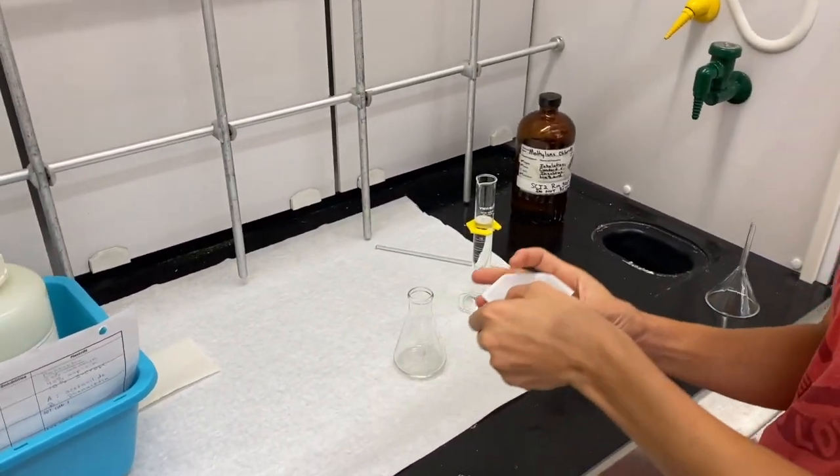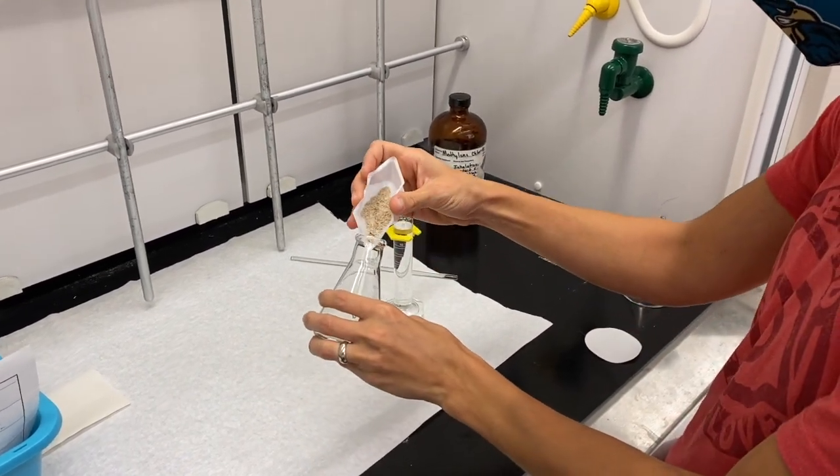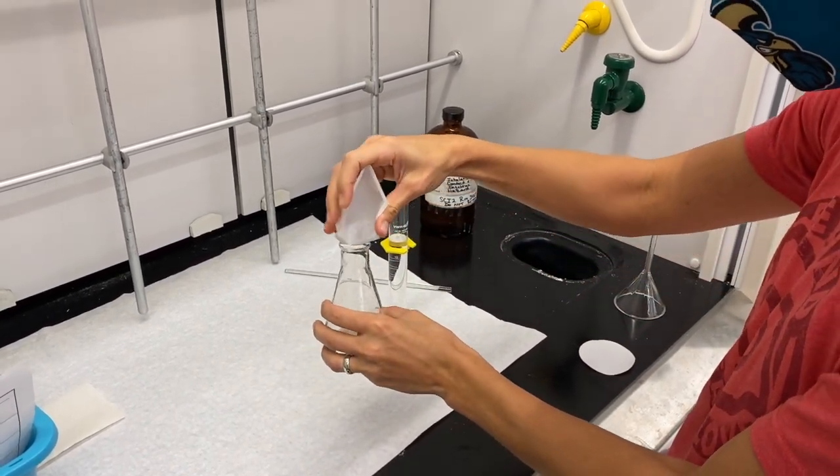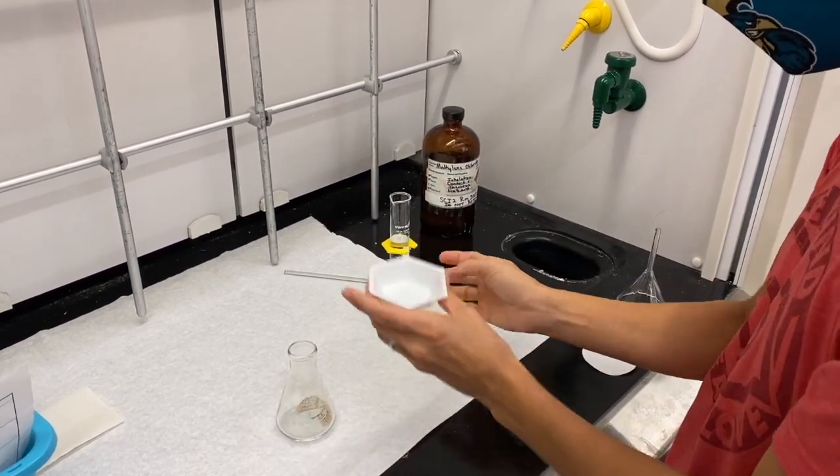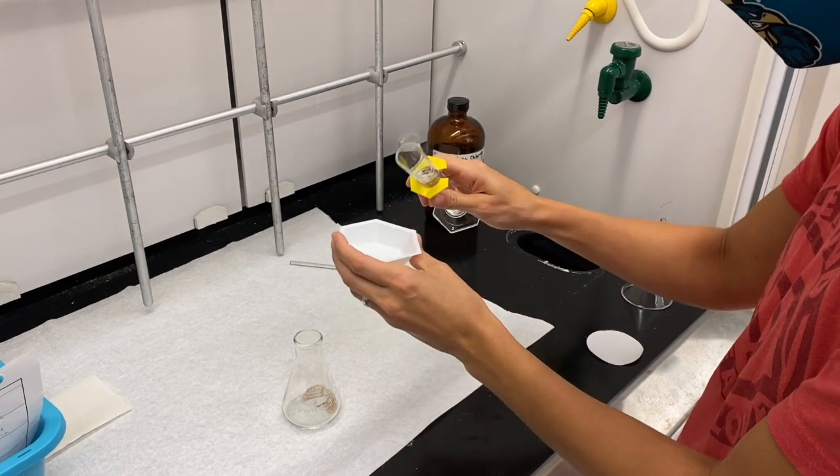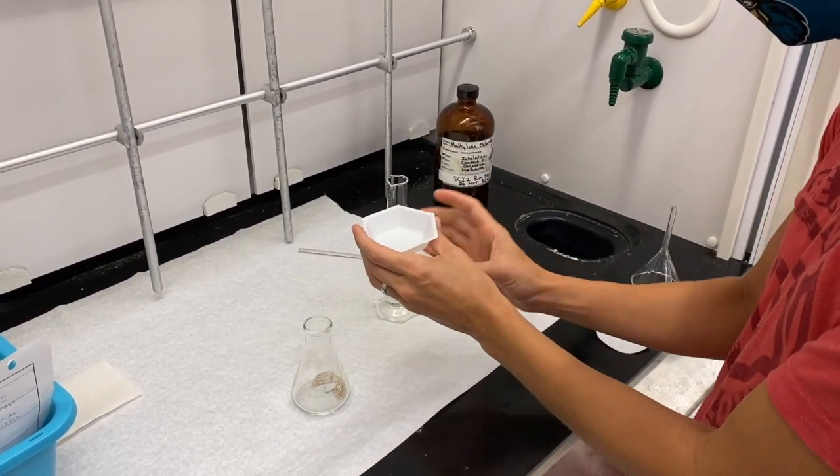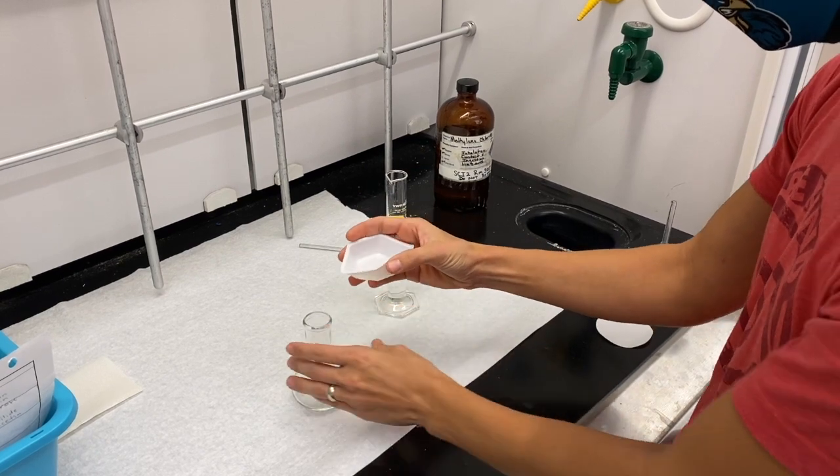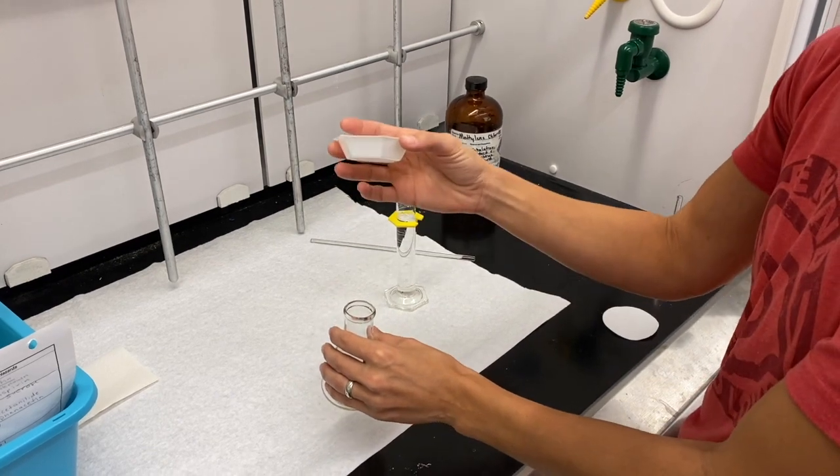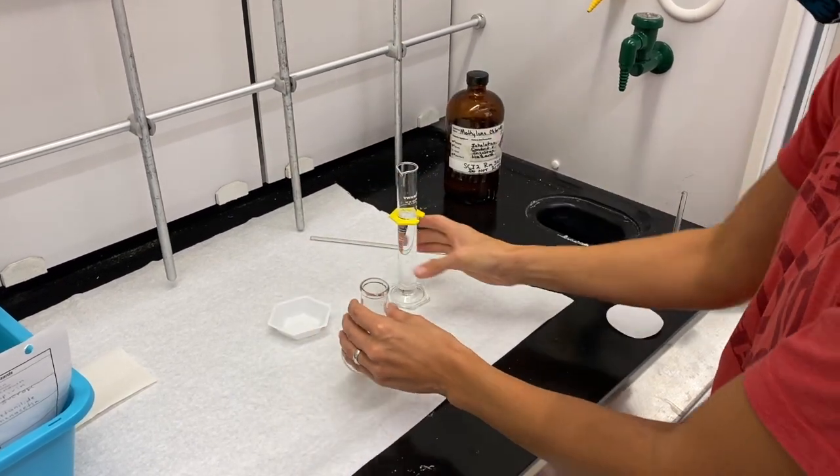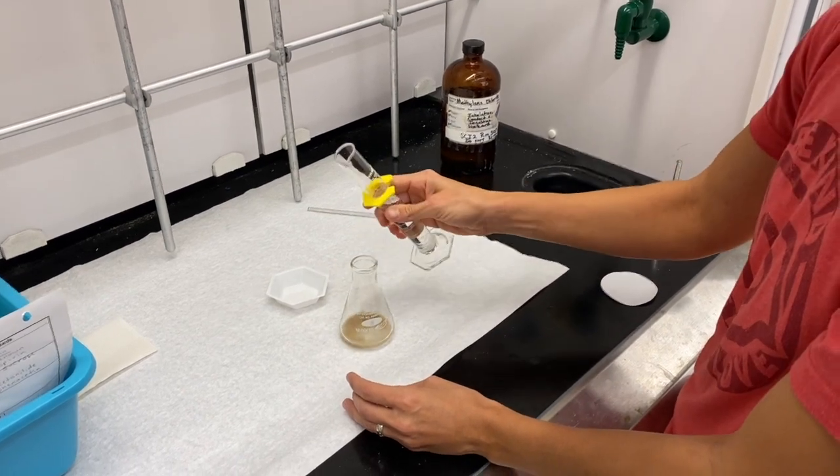So we've got Panacetin A. We're going to pour into this Erlenmeyer flask, and we don't want to lose anything. We're going to minimize some transfer loss, so I'm going to pour just a little bit of my solvent in here. The solvent is dichloromethane, which typically melts plastic, so you have to get me fast.